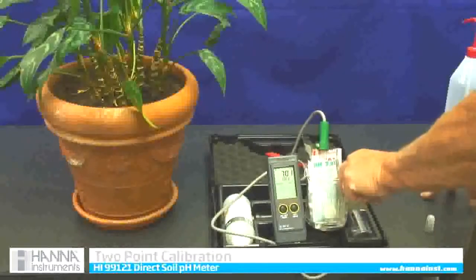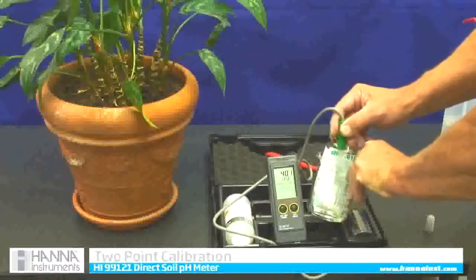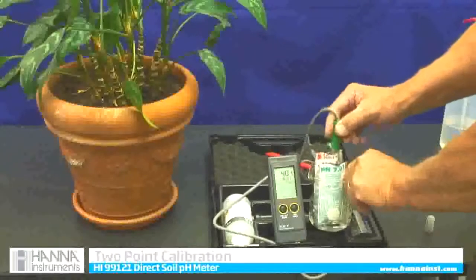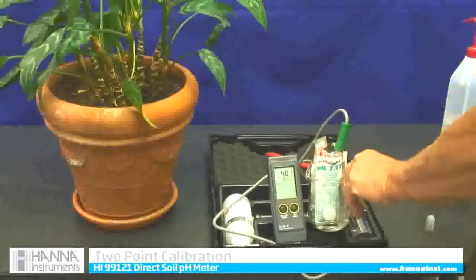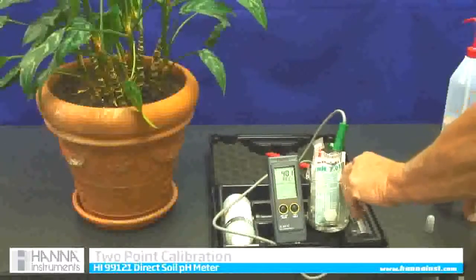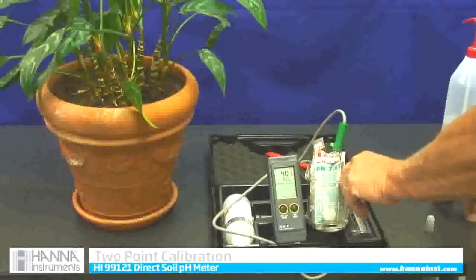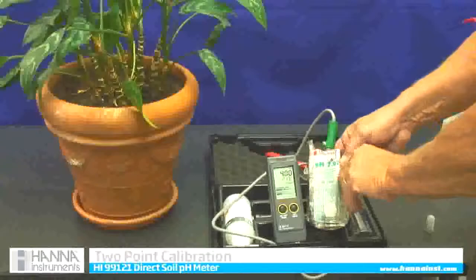It might take about 30 seconds. I am going to rinse it off with a little bit of tap water, and then it is going to say use 4.01. I put it in 4.01 and it recognizes that. I could use a 10.01 if I wanted to, but in agriculture we use the 7 and 4 two-point calibration. That makes it very accurate. If you can read it, it says okay, two points.